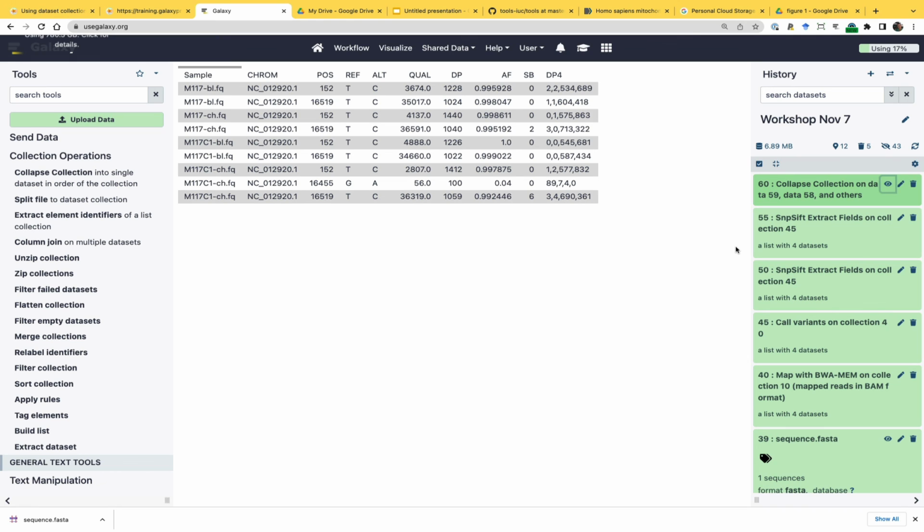The counts are so low that it might be the real thing. And actually, in the real data set, because I only sampled 1,000 reads here, it is a variant at this position. So there is a difference between child and mother at this particular site. But because I have a subsample of reads, and it's sort of a corner case, I don't know whether it's a good variant or not.